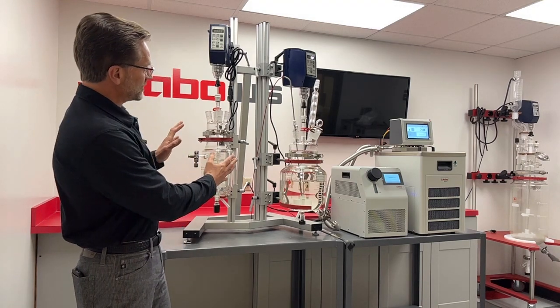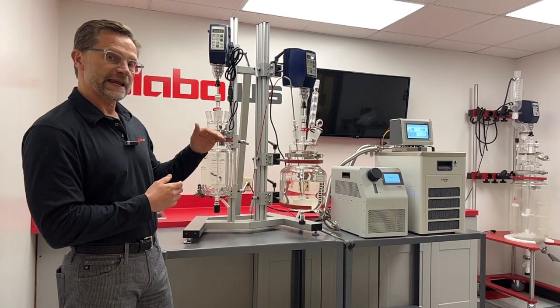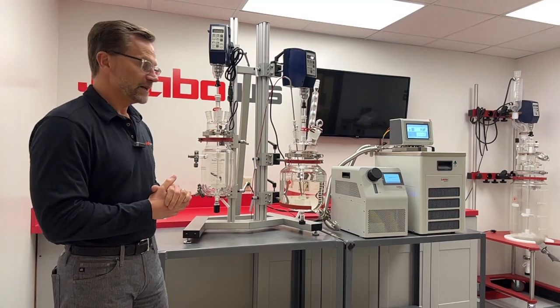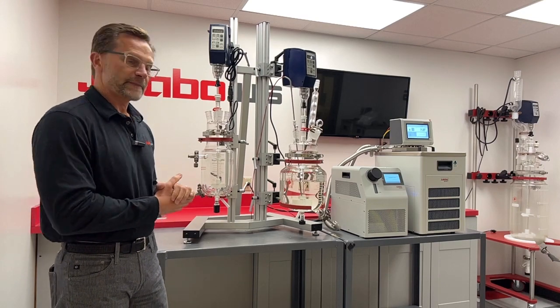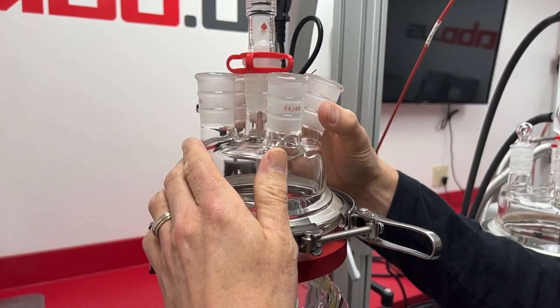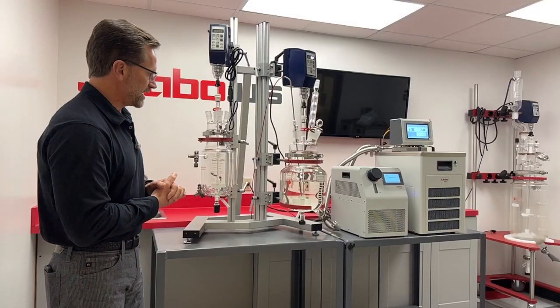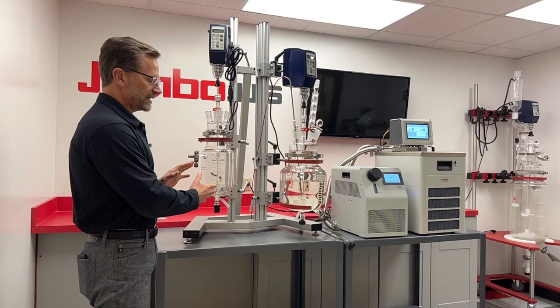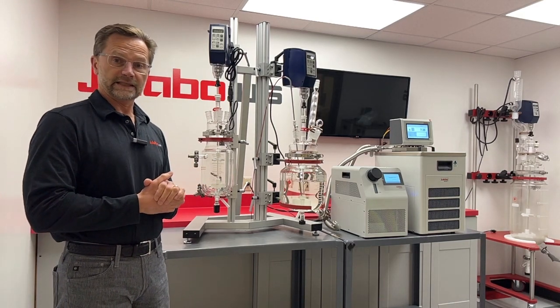The benchtop Ace dual reactor stand is available in two models with either 38 or 48 inch height adjustment. We have anodized aluminum extruded aluminum frames that have infinitely adjustable clamps, so you can get precise positioning of any of your devices. The dual reactor stand can accommodate vessels in size from 100 milliliter up to 6 liters in volume.